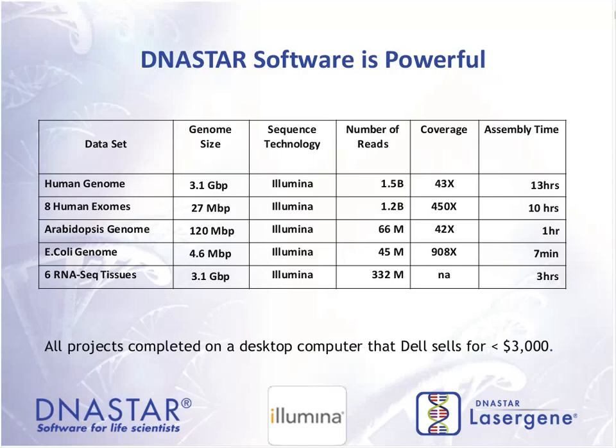This is done on a computer that you could purchase at Dell for under $3,000. If you can build your own computers, we can help customers with that, and you can drop this price below $2,000. So really just a sturdy desktop computer, we can get excellent performance.